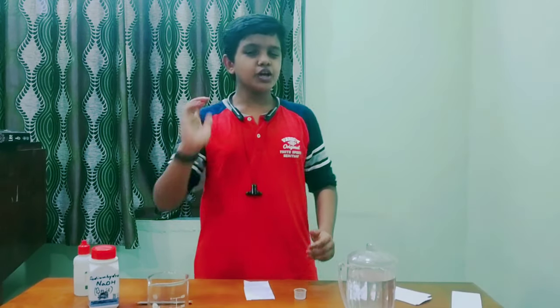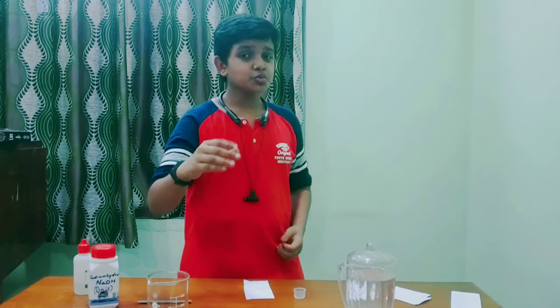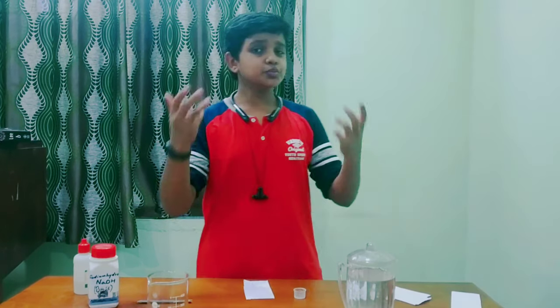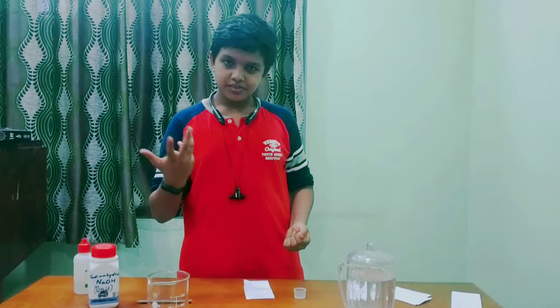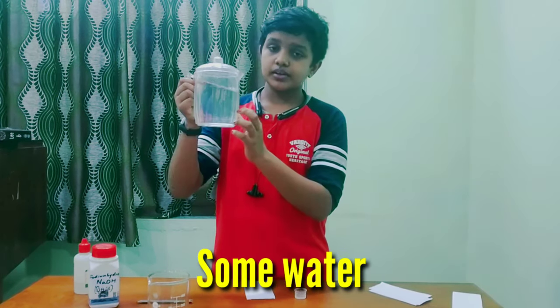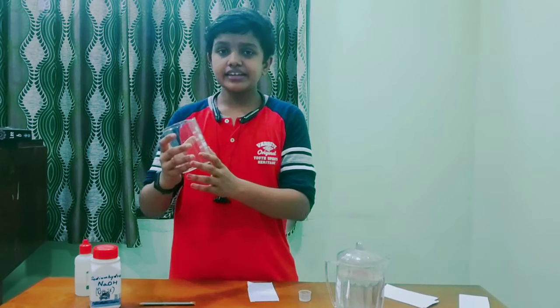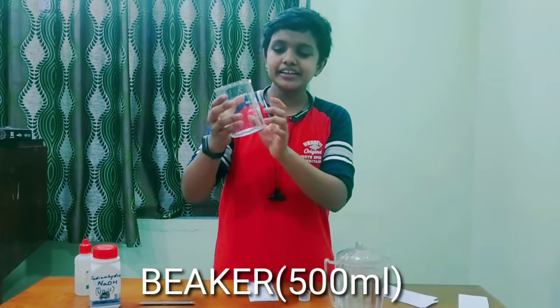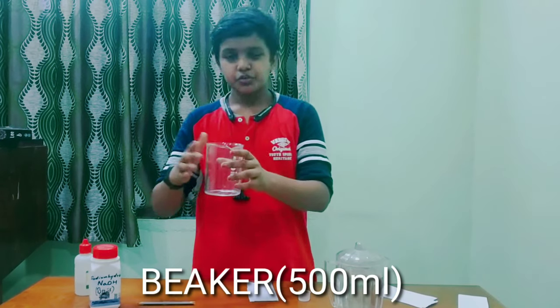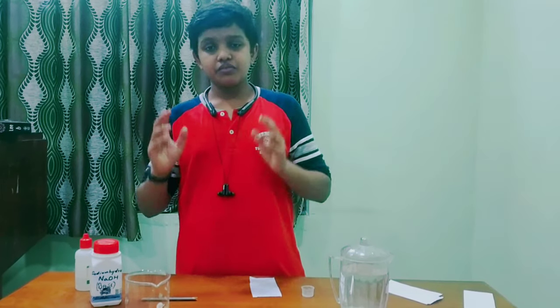So guys, now we are going to make the invisible ink. Things required to make the invisible ink. First we need some water, and second we need a beaker. I take a 500ml beaker — you can take any measurement of beaker. And next we want two chemicals.